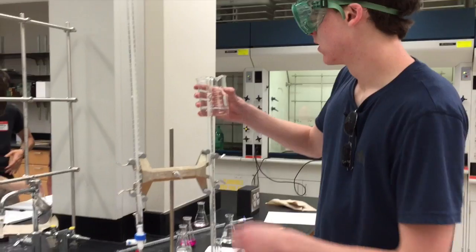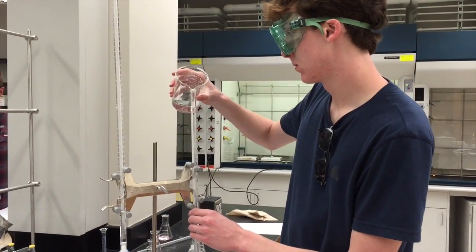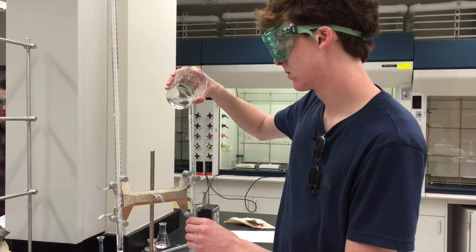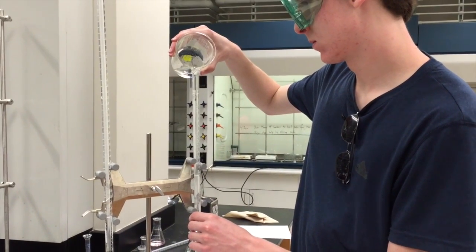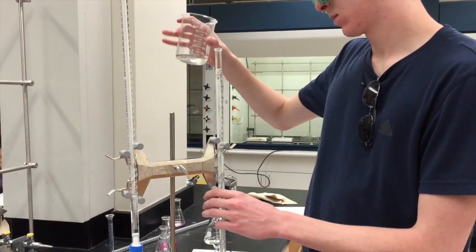Make sure the stopcock is in the horizontal position and pour in the sodium hydroxide with the burette below your head. Also be sure that there are no air bubbles at the tip of the burette.